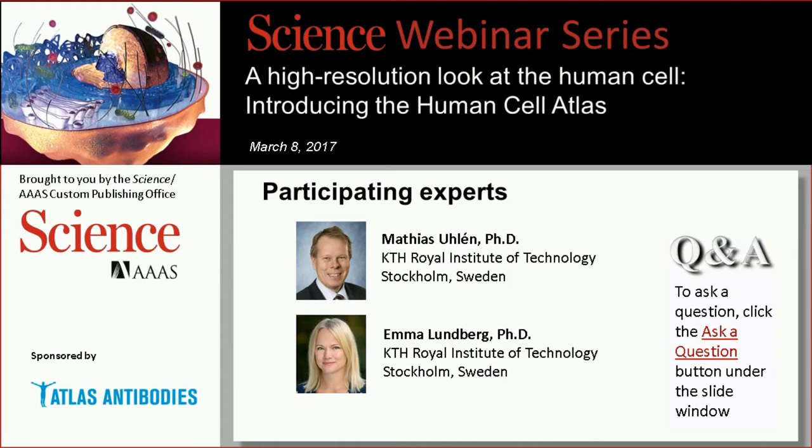And perhaps you could answer this question as well. I thought this was interesting. The viewer says they know the cell atlas was released in December, but for how many years prior to release have you been actively producing data and images for the cell atlas? Yes, so we took the first image in 2006.